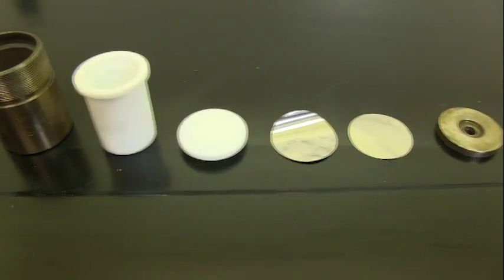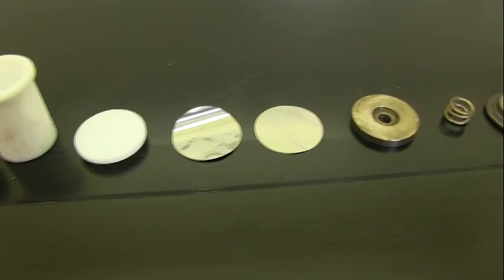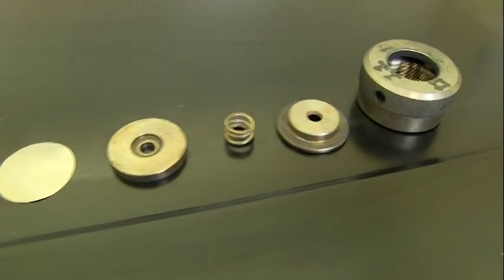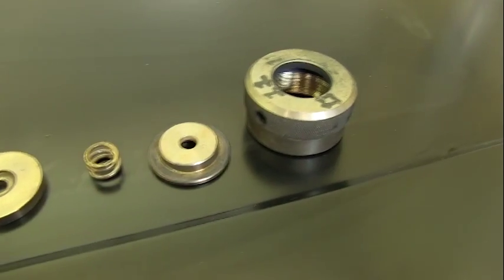Pressure relief or safety rupture disks are provided in most laboratory reactor pressure vessels to protect the outer vessel and the operator from unexpected or dangerously high internal pressures.